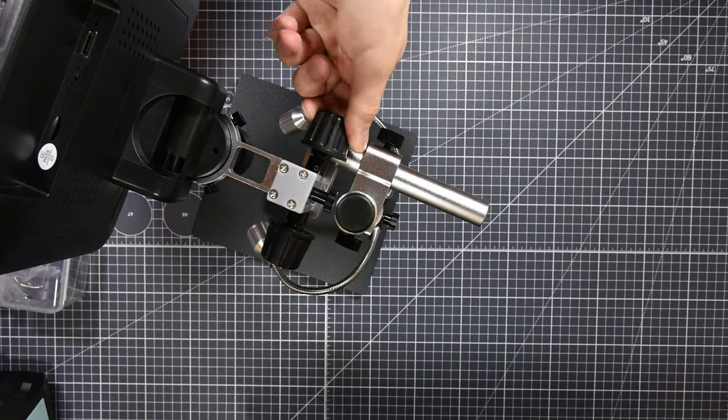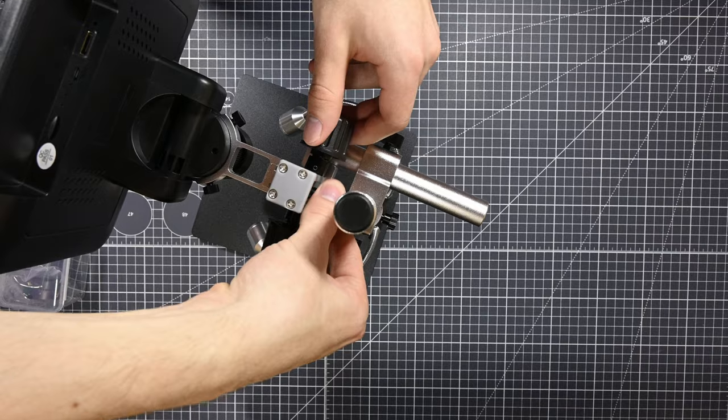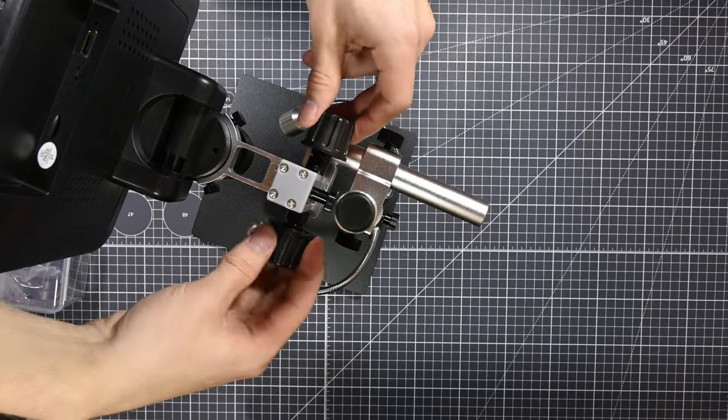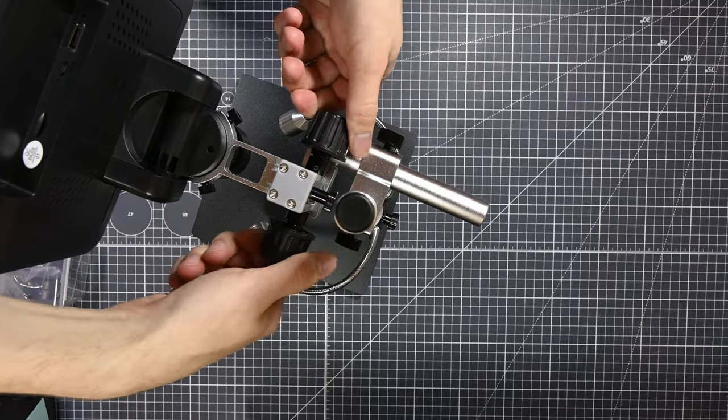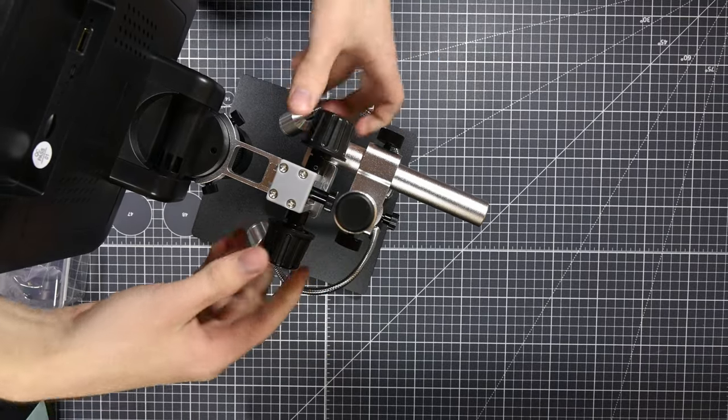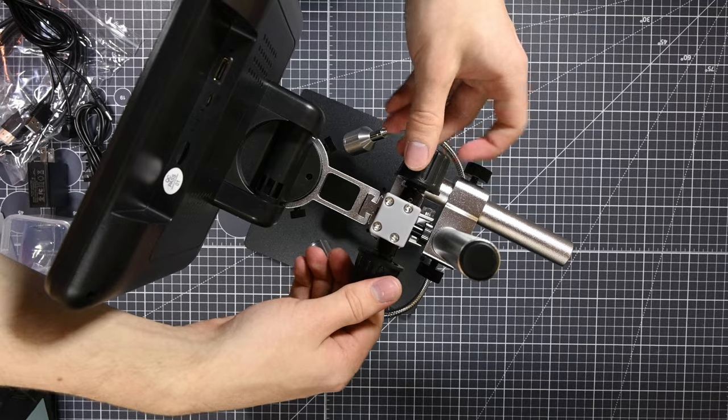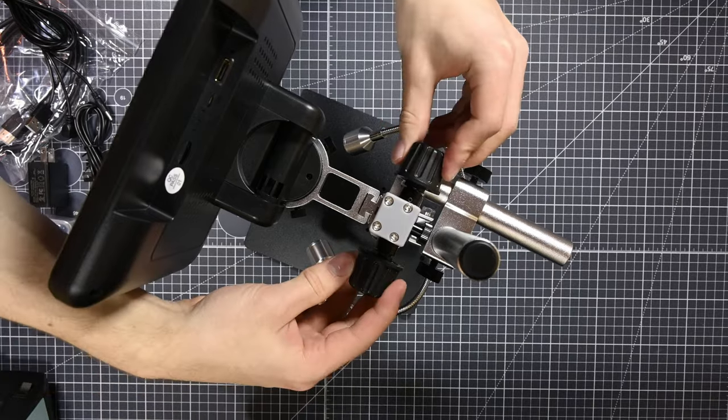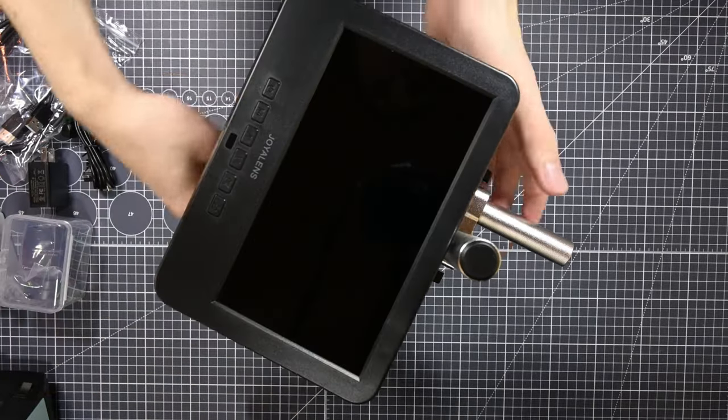I will give credit where credit is due though, and say that the focus slash fine height adjustment knobs feel really nice to turn with some good resistance, so setting the focus precisely with these control surfaces was very easy, which I'm happy to see.